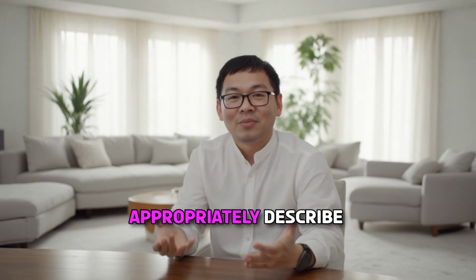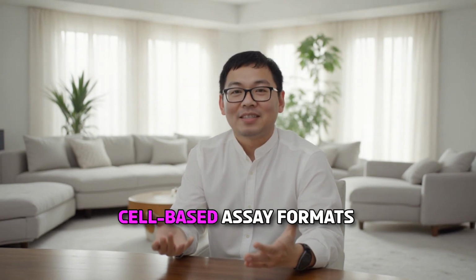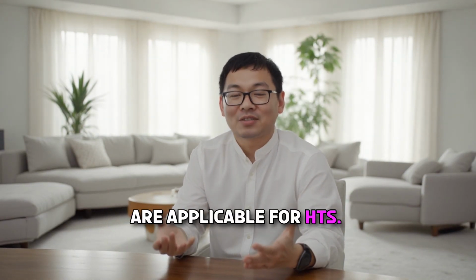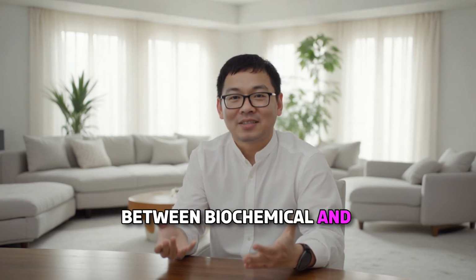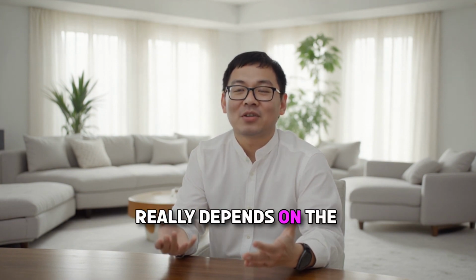In this video, we will appropriately describe when biochemical or cell-based assay formats are applicable for HTS. So when it comes to high-throughput screening, HTS, choosing between biochemical and cell-based assay formats really depends on the kind of information you want to get from your screen.